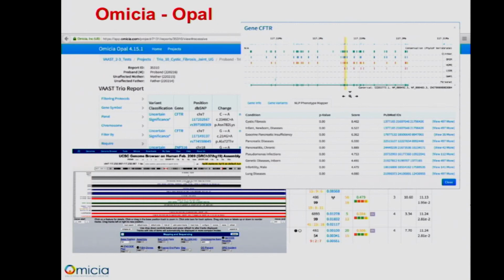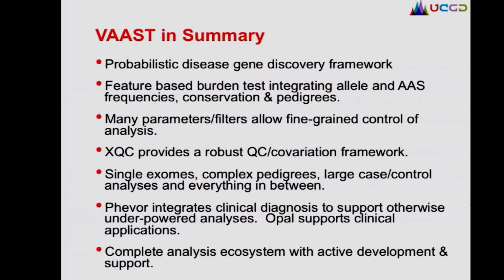I like to use it now too. It's gotten good enough now that, for a simple case, I'd rather just do it there than do it on the command line myself, because it's less copying and pasting to look at things in the genome browsers and to look up disease or gene names that I don't know about.